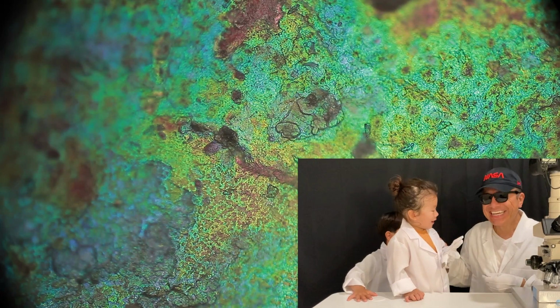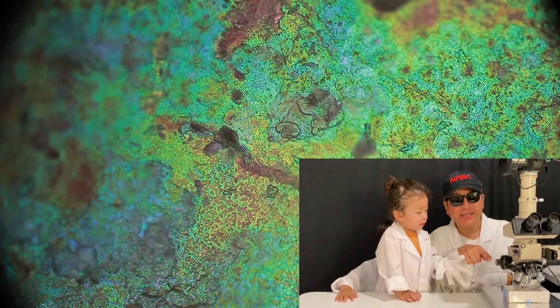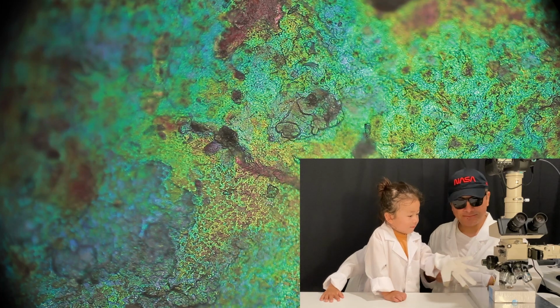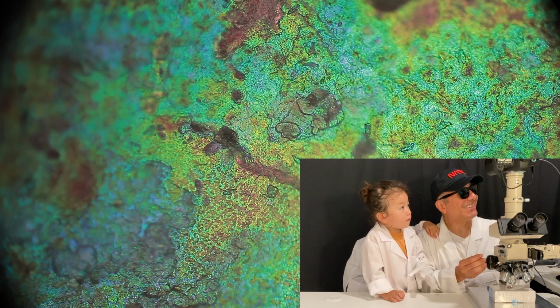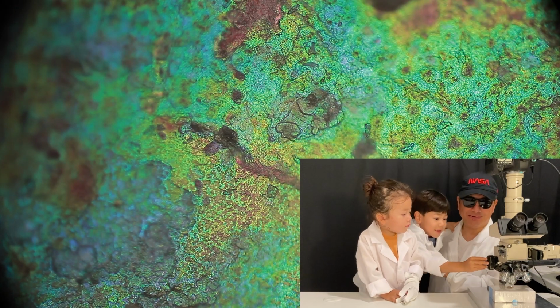Did you want to focus on it? Yeah, this is the focus now. There's the fine focus and the coarse focus. This one is the fine. Do you want to touch that one? You can turn it. Oh, it's a little bit blurry. Oh, all right, you may turn it a little bit.